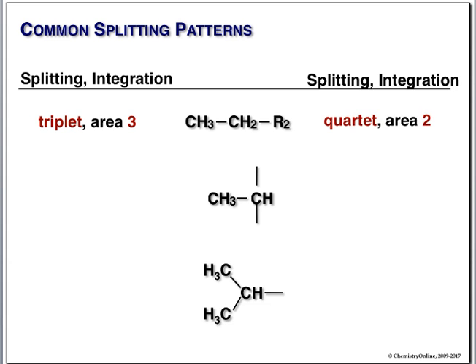The next one. What's the integration going to be? What's the area? It's going to be 3, isn't it? 3 hydrogens. How many hydrogens is it next to? 1.